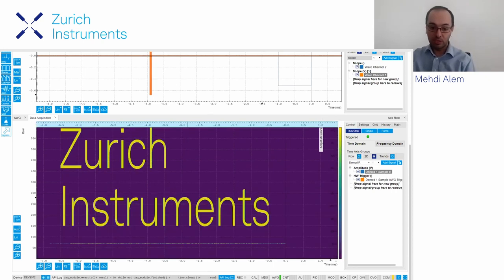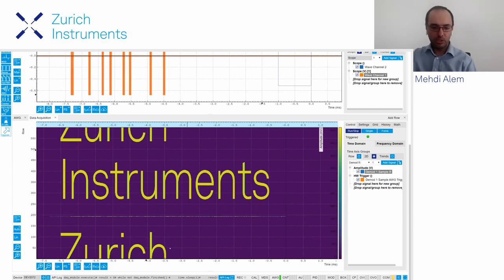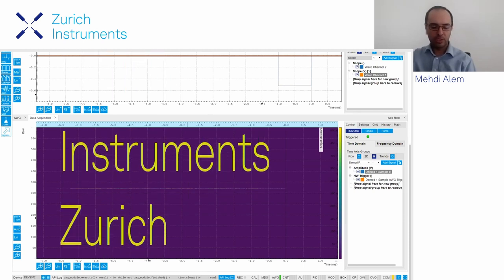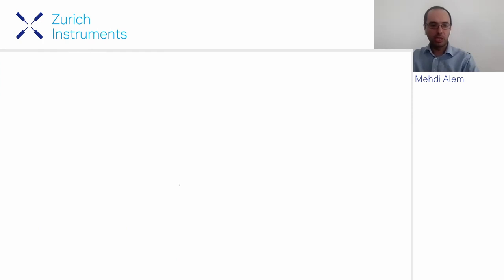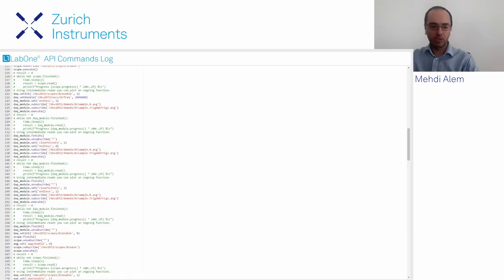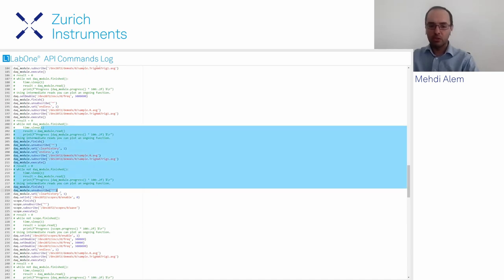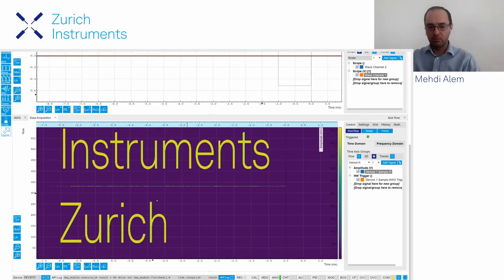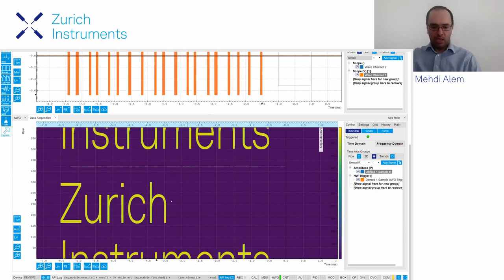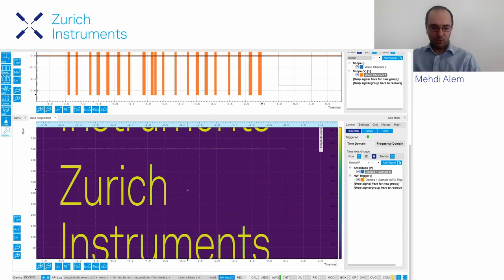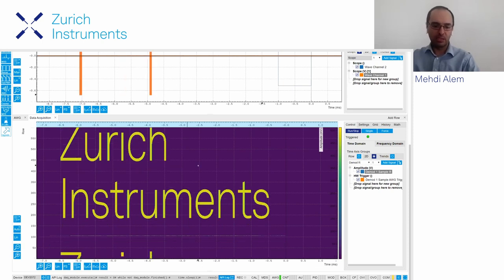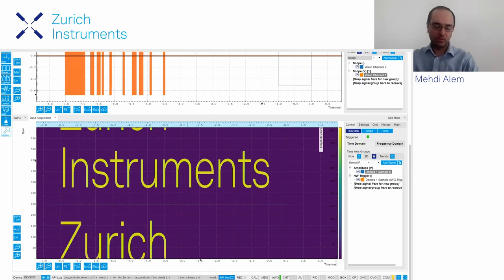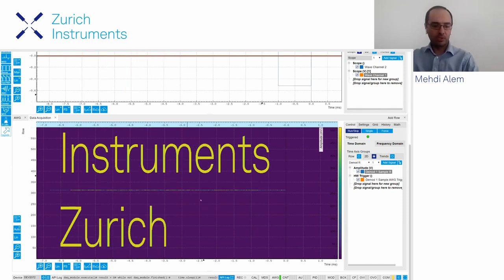The same thing you do in the GUI you can very simply transfer to the API. We have this API log page here that shows what I've done as API commands — you just need to copy and paste this into your API script, in this case Python, but it can be any of the other APIs we support. With that motivation to see how it's done in the API, we can move to Lyon where David and Adrianos will show us in a real AFM measurement.